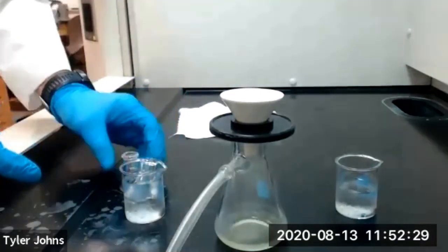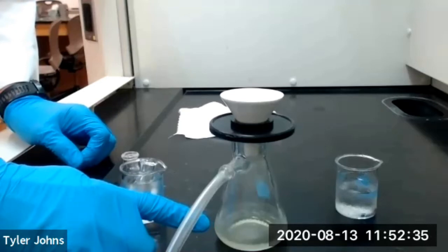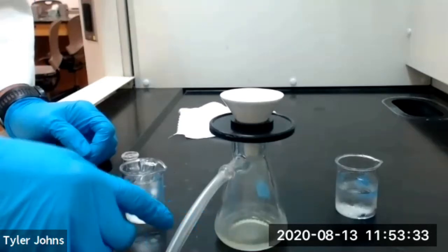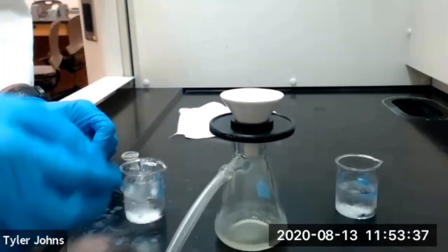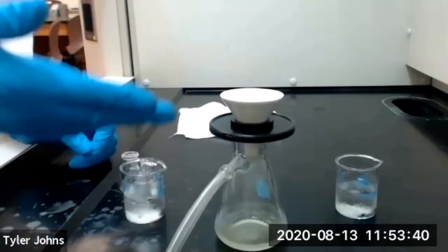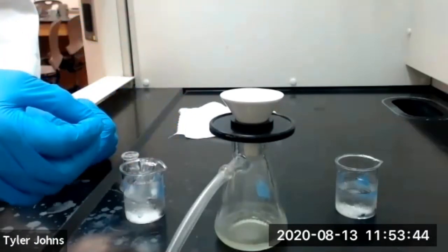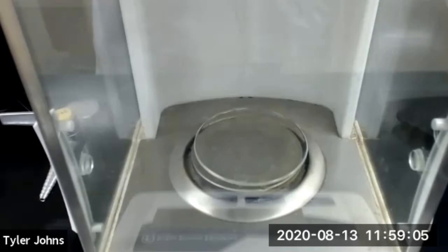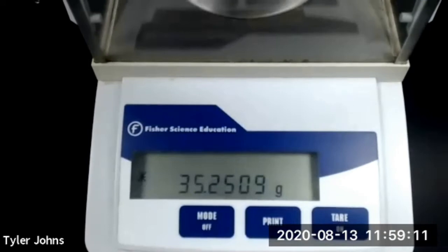We want to be sure that we save our mother liquor from our filtration procedure for the optional exercise at the end of this experiment. We'll now air dry our crystals by continuing to pull a vacuum for an additional five minutes. In the meantime, while our crystals are drying, we'll pre-weigh a watch glass. The mass of our watch glass is 35.2509 grams.